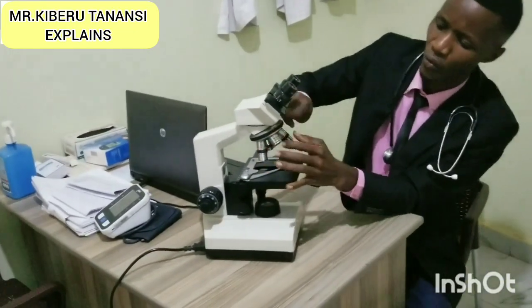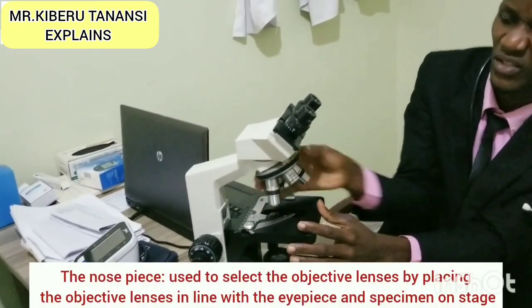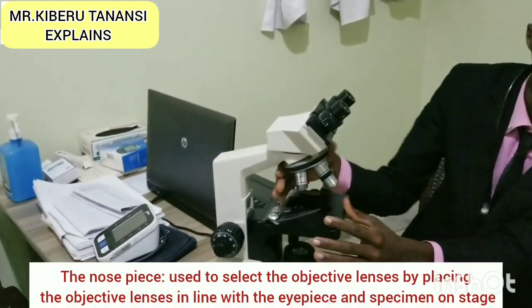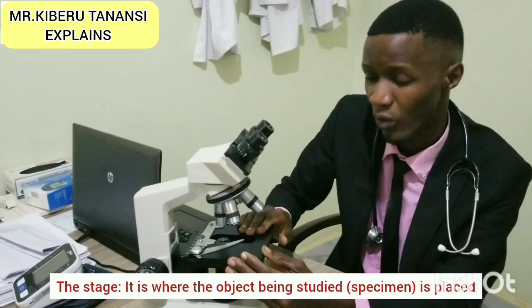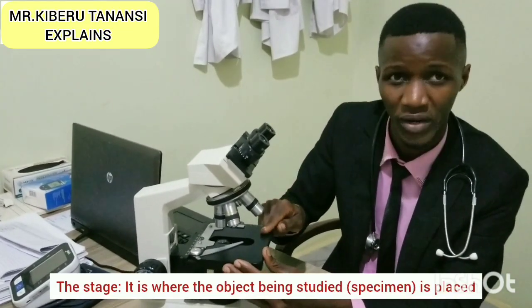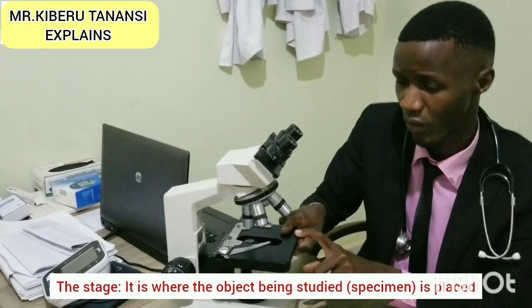Then on this part where these objective lenses are sitting, this one where I hold to turn, is called the nose piece. It's where we hold when we are turning these lenses. From there we have this black base, this black part which is called the stage. We call it the stage because it is where we put our specimen, the object we want to see. That's why we call this one the stage. It is the stage for the specimen that we are going to see.